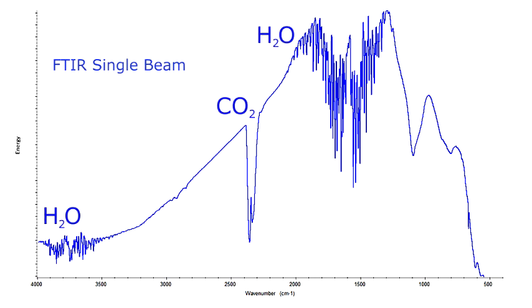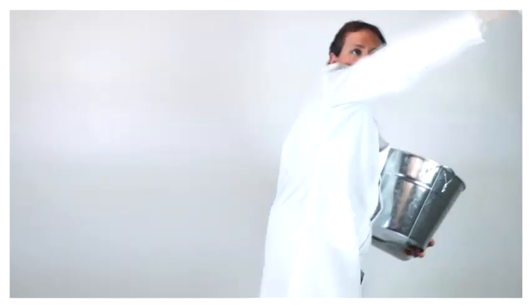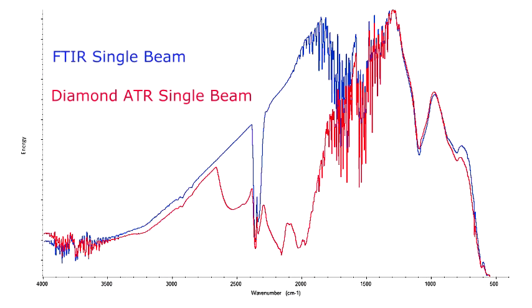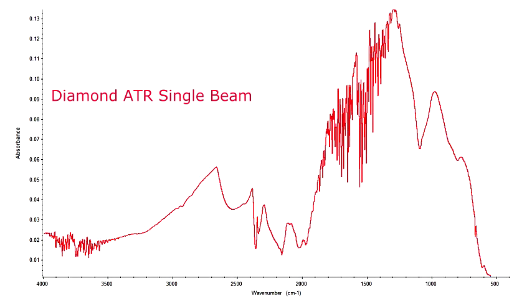We will now layer the background spectrum of a clean and dry diamond crystal from Pike's multipurpose Miracle ATR, the accessory used in this example. In addition to the atmospheric features, we also observe the characteristic absorbance from the diamond phonon bands found with all diamond ATRs.